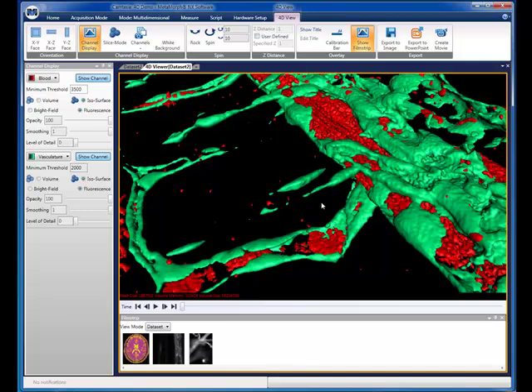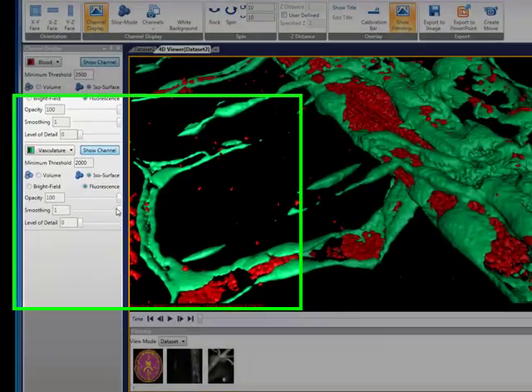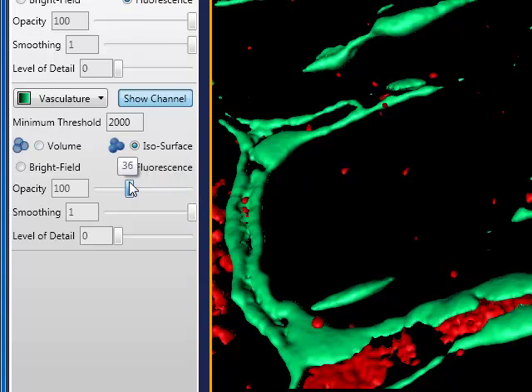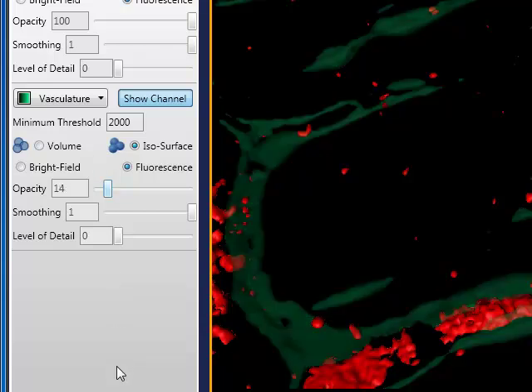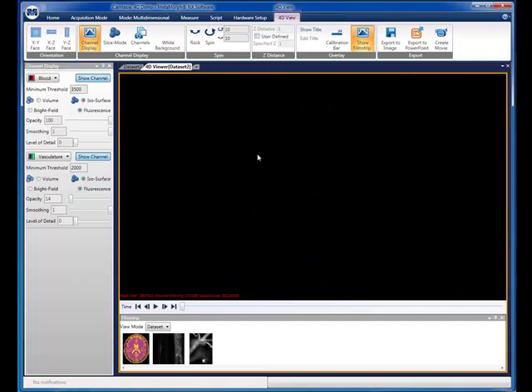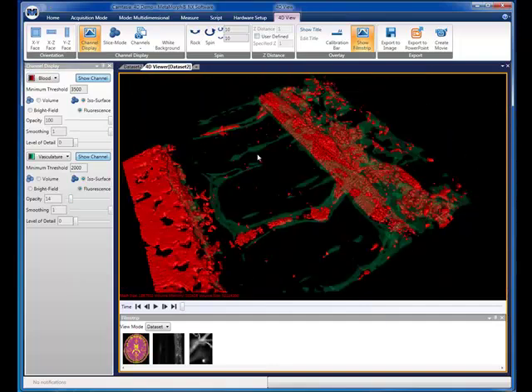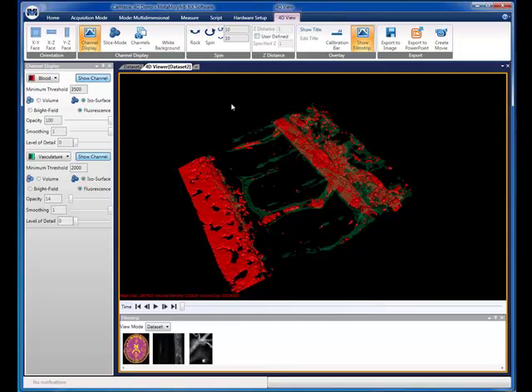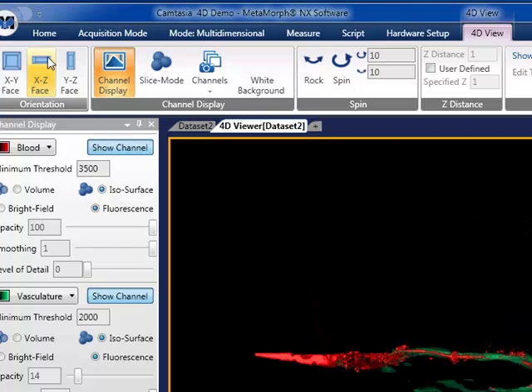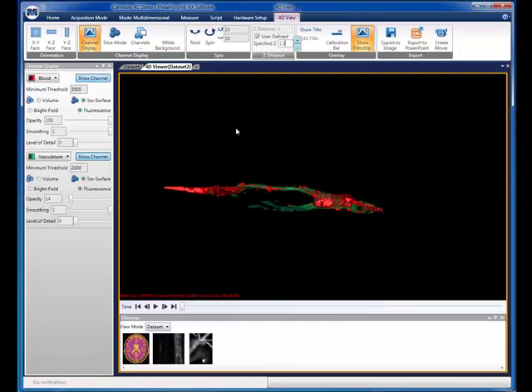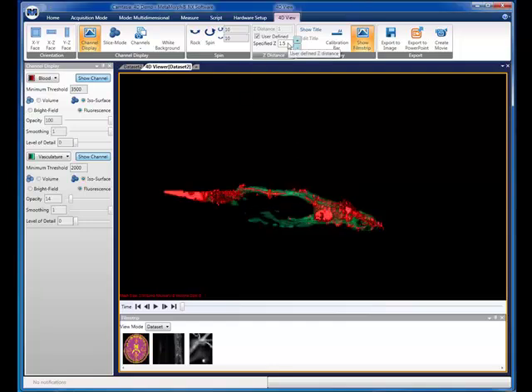To help us see inside the structure, we can adjust its transparency. See how the vasculature becomes transparent, allowing us to see the blood that lies behind the vascular structure. Sometimes your samples may appear compressed along the Z axis due to sample mounting artifacts. A Z scaling factor is available to help compensate for this artifact. In this example, we will set the Z scaling to 1.5 and observe how the structure is elongated in the Z axis.